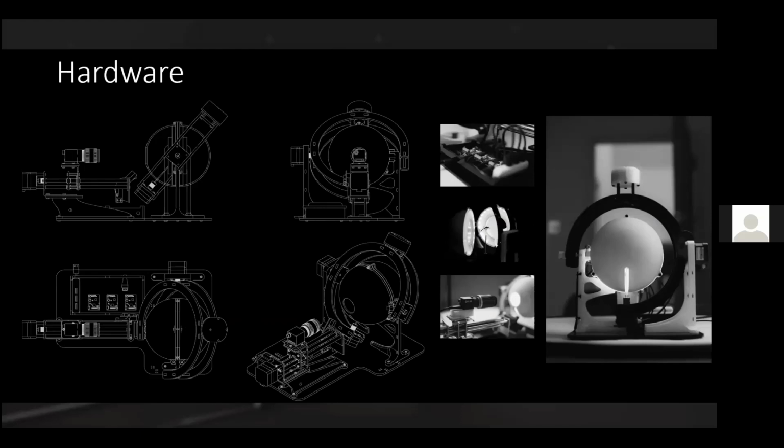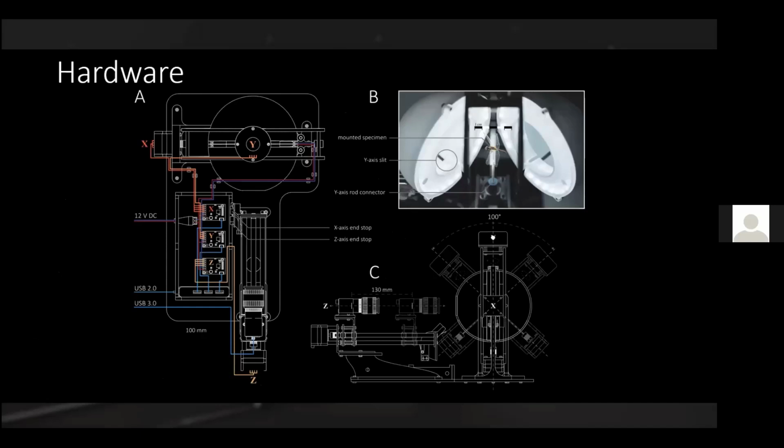So we move the focal plane through the depth of the specimen, and then we generate multiple images, and in the end can generate one single image with only pixels that are in focus from that particular perspective. There's a second slide that shows this in more detail here. Top drawing also with some of the technical components, the motors, the control, the steppers, etc. And in the bottom, you see the process maybe a bit more clearly illustrated.